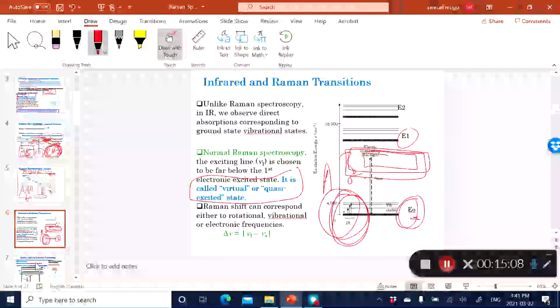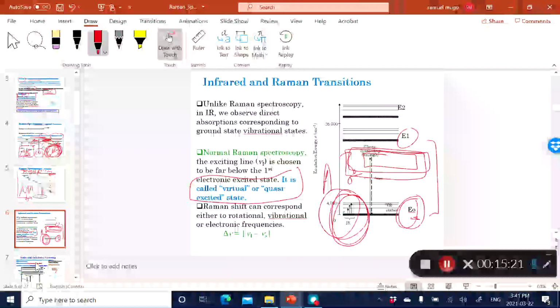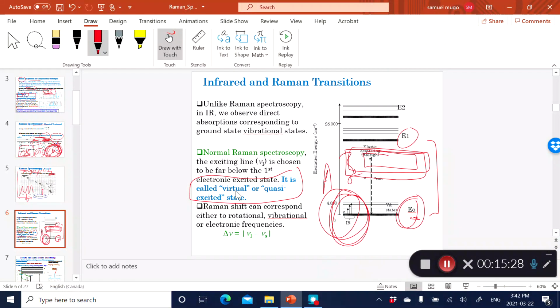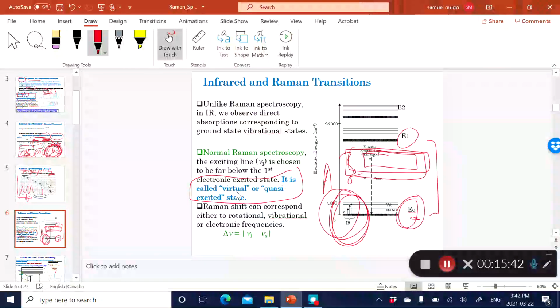And so essentially, there are quantum transitions that occur, for certain types of molecules, where those vibrational levels are in between those two electronic states. For that reason, we are calling them virtual, because in reality, they are fairly different from the typical vibrational states that are present in electronic states. So in this case, it's a bit different: they are vibrational states that are in between two electronic states, and as such, they are virtual. And that is what you refer to as the Raman shift.